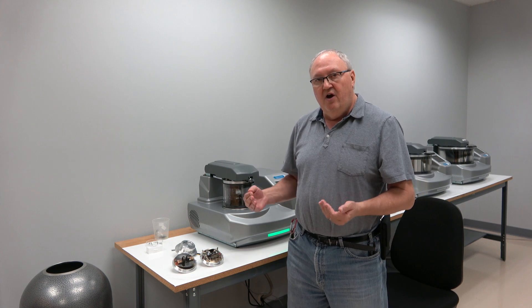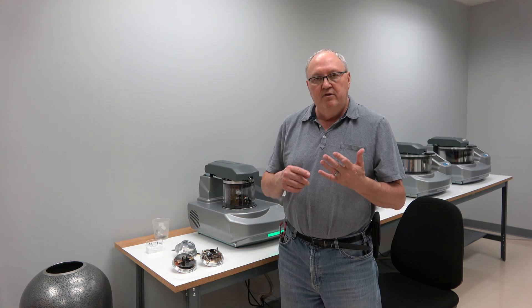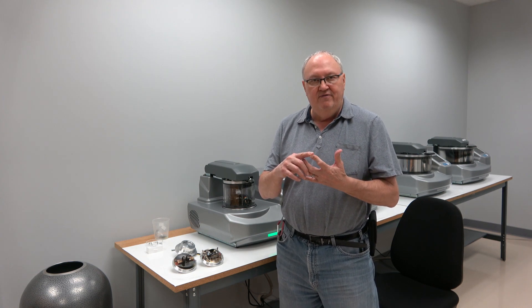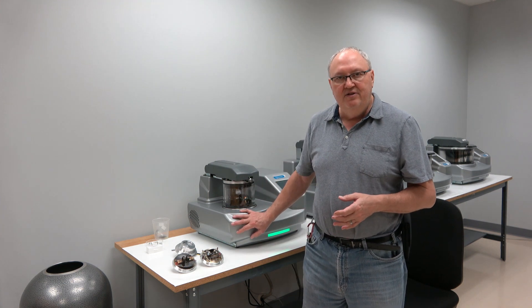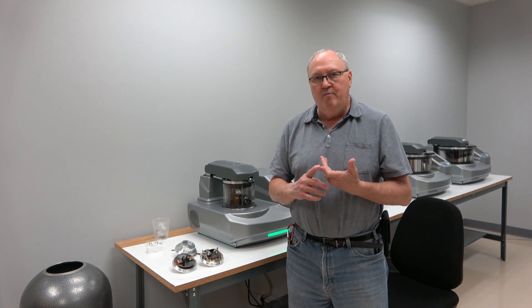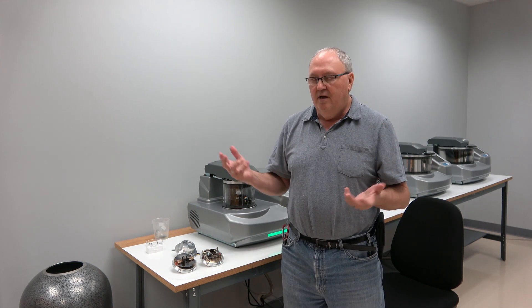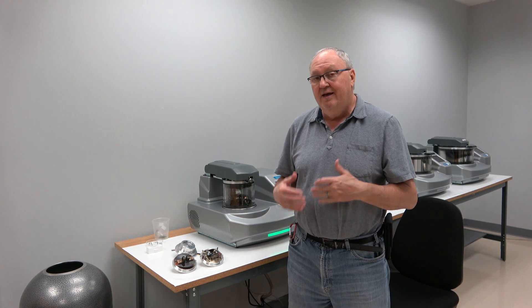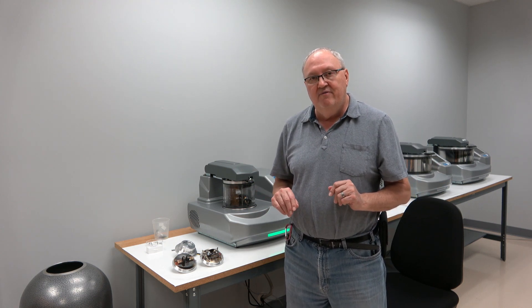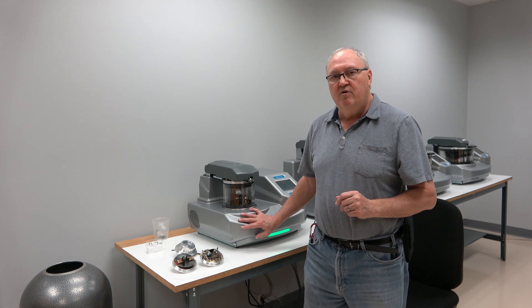The 150 R is really only limited to a few basic metals to sputter: silver, gold, gold-palladium, and platinum. Whereas in the 150 T you have a wide range of metals — copper, titanium, ITO, chromium, tungsten, iridium, platinum — a very wide range of metals. This is because the vacuum is better. The VES can cover that whole gamut of materials as well as some others, because the vacuum quality is quite good.